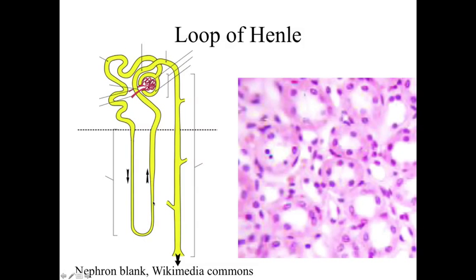We're going to go down into the loop of Henle, diving down into the medulla. What we'll see are tubules running in the same orientation, with some thicker limbs and some thinner limbs. The thick limbs have a thicker epithelial lining; the thin limbs have a thinner epithelial lining — still a simple cuboidal or low cuboidal epithelium. The loop of Henle establishes an osmotic gradient through different properties between the descending and ascending limbs — review the lecture notes for its function.